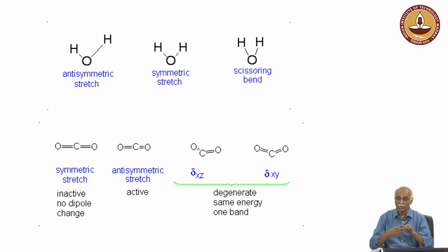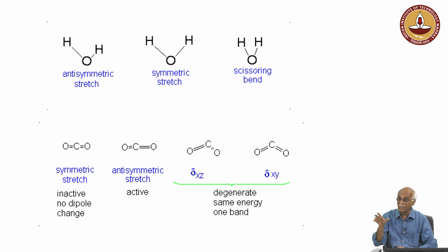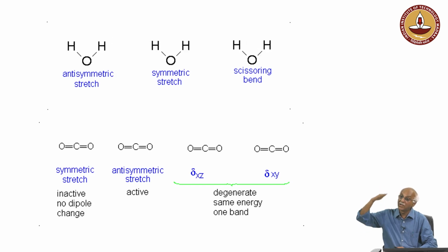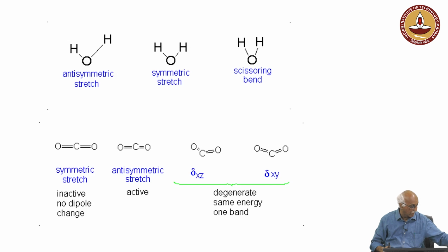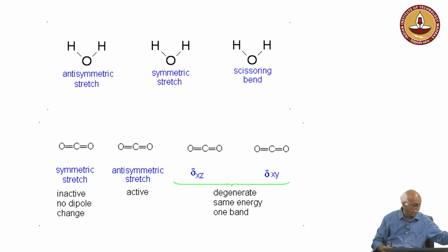Basically, in the case of a molecular structure, the distance between atoms determines the energy states. So, those energy states will start changing. Of course, there are certain rules that these energy transitions follow, and we will observe such bands.